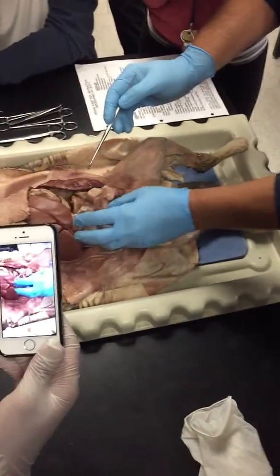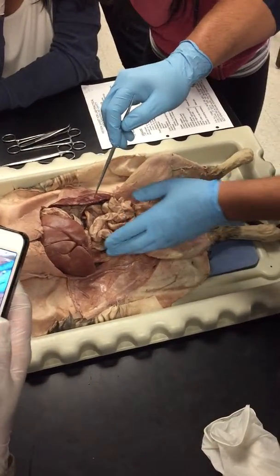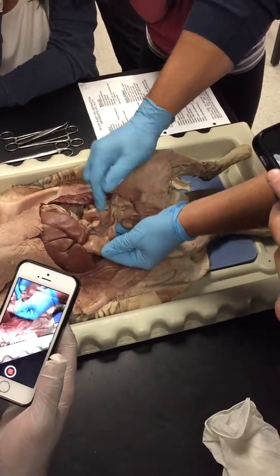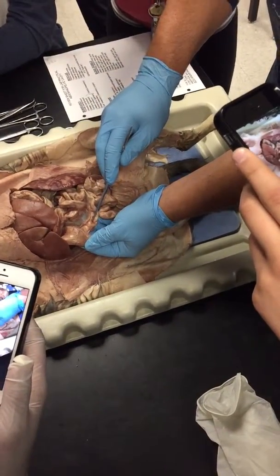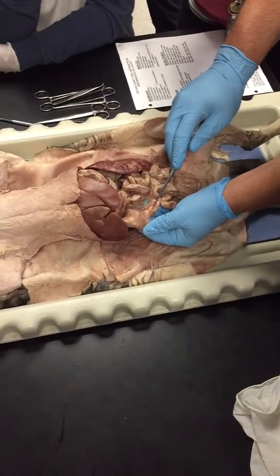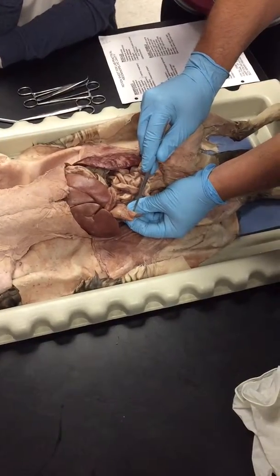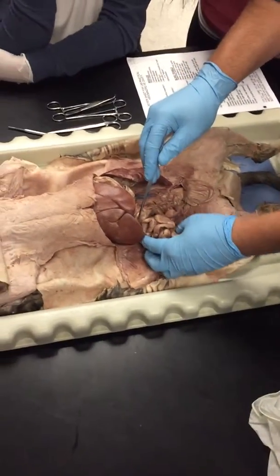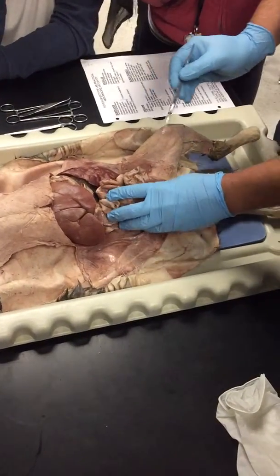Okay. If I put a pin really just about anywhere else, jejunum. Now, it might not be the jejunum, but I don't want to confuse you guys. If I want the end part of the small intestine, I'm going to put the pin right here at the end where it's obvious. Here's the large intestine, and if I put the pin here, I want the second half of the small intestine, which is the ileum. What's this little nub right here of the first part of the large intestine? The cecum. And then this whole thing right here is the large intestine.